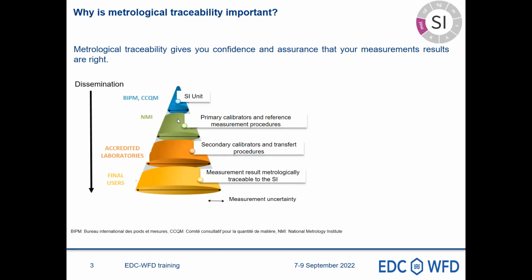Here, because we are in a research project focusing on metrology and involving NMIs, we are developing these primary calibrators and reference measurement procedures to allow all the others to be related, and to allow the final users and all the laboratories to be traceable in this way.